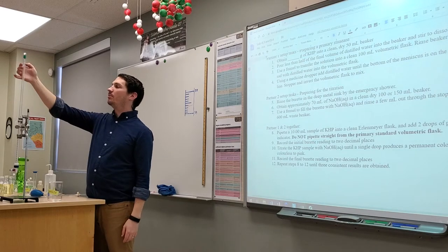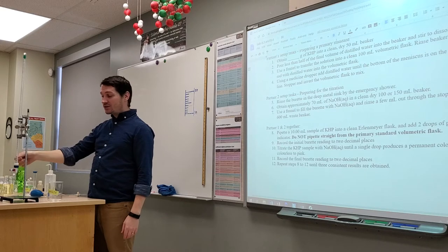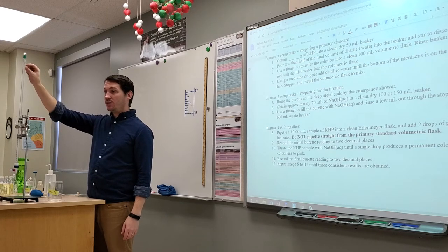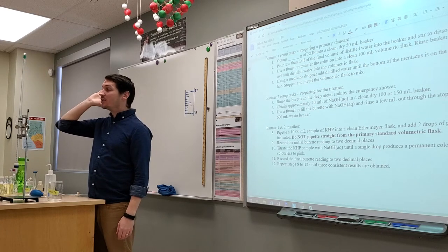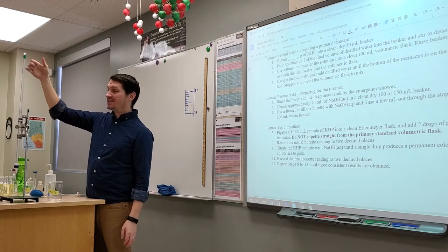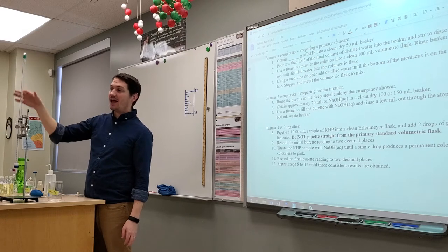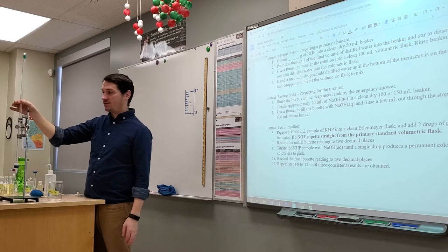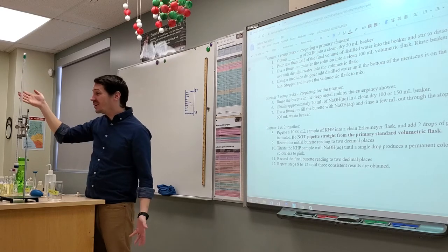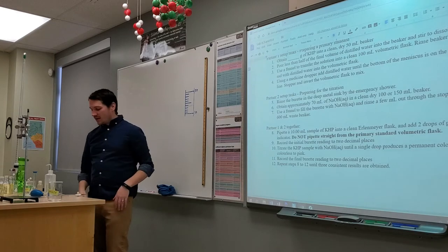Can you fill it above the top line? Mm-hmm. You can. You just got to empty it so that it goes below the top line. Please, for the love of goodness, don't try to have your meniscus stop at zero. There's no point. It's a waste of time. You still have to measure your initial volume and measure your final volume to get the volume difference anyways. There's no point. Just don't worry about it. So we've got our burette ready to go.